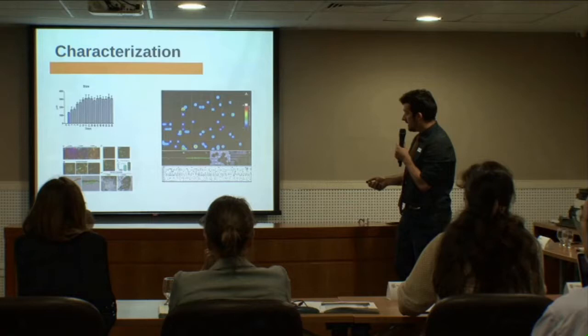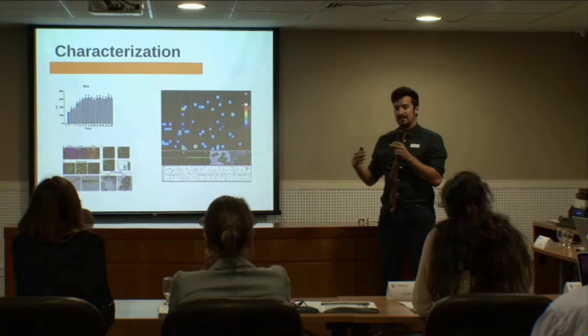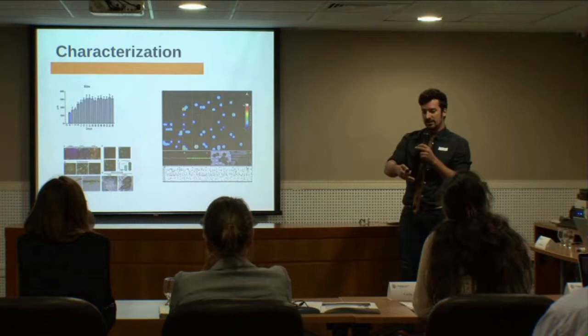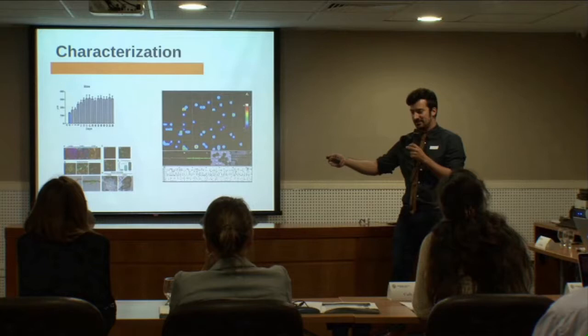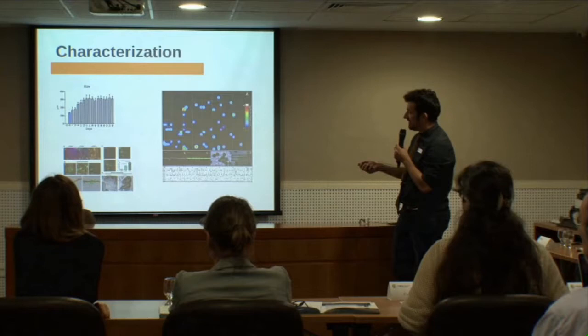As I say, for us it was really important to use the shaker in our case because we want to control the size. So as I was saying, we want to have the same shape, same size, and same composition every time to be able to predict toxicology, right? Because if you are going to do different treatments and some aggregates are bigger than the other ones, or some have more astrocytes, then the readout will be different for the different chemicals. So here we did different experiments, and after several tries, we make sure that we have around 300-350 micron spheres.